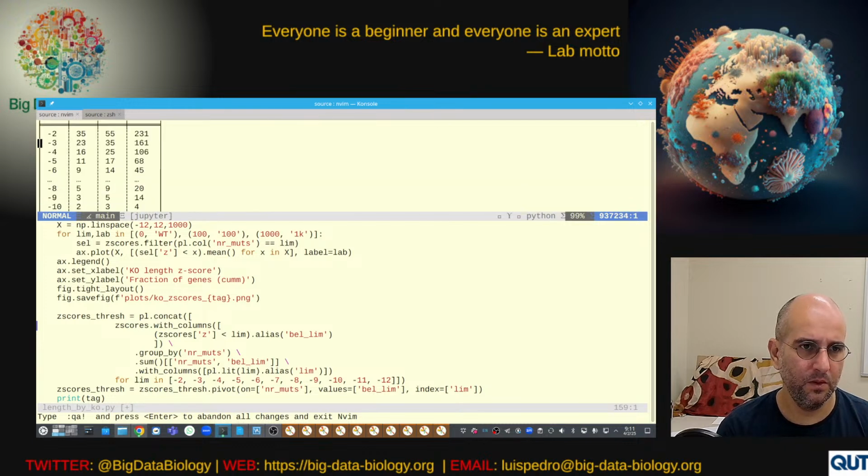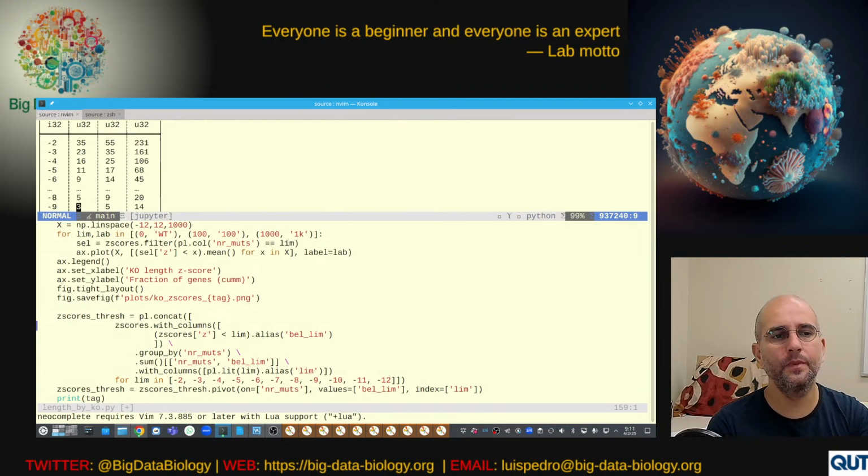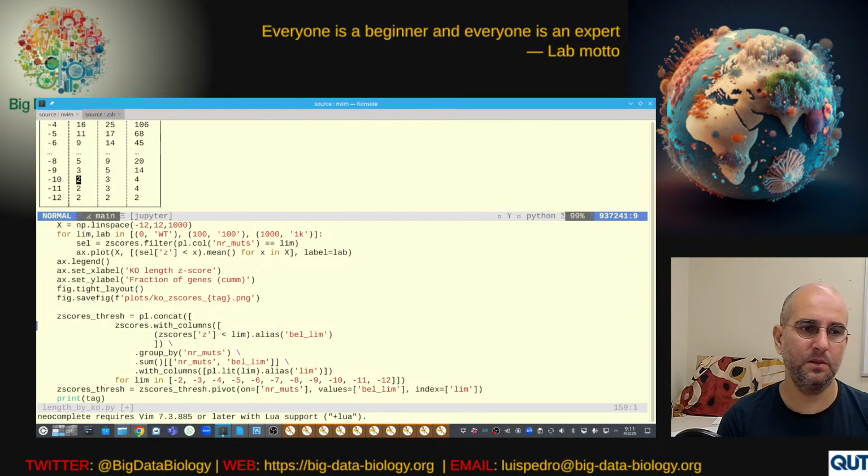We've looked at E. coli, we were looking at these ones. So this table is E. coli, and here we're looking at zero mutation, so this is the reference genome. The reference genome from E. coli is probably as good as it is, so maybe the annotation is not perfect, especially with the methods we're using, but the genome itself is probably as good as it's going to get.